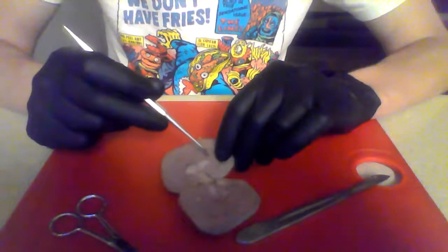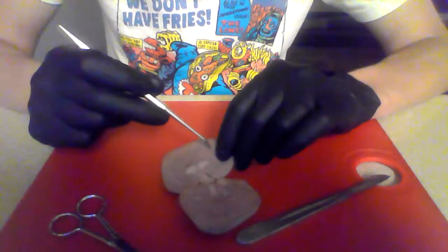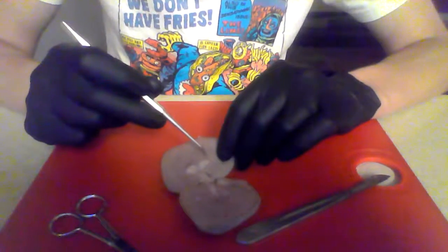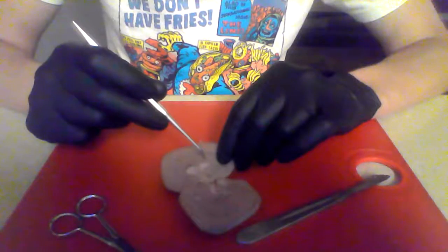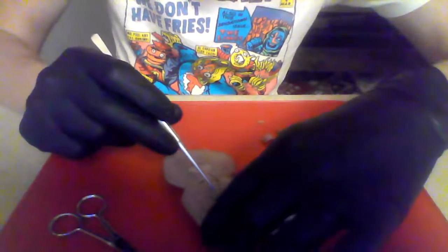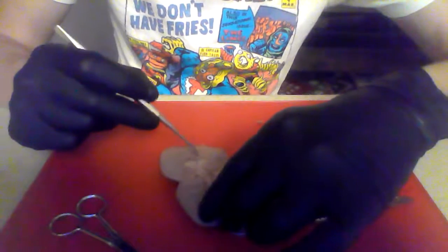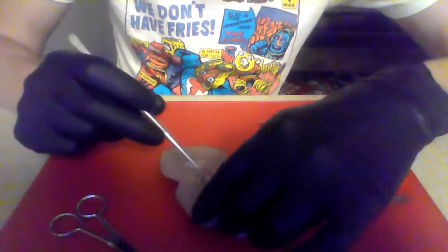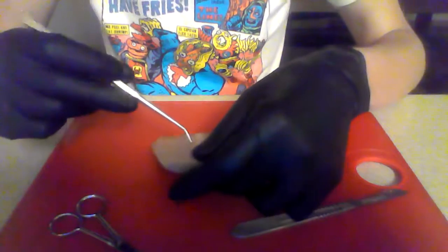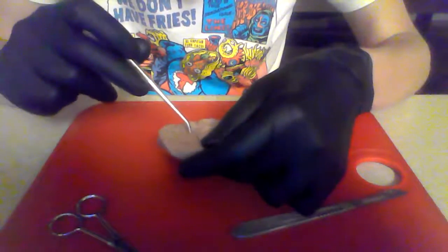I had mentioned before that we have renal papillae. What happens there is urine is discharged through the renal papillae into a structure that is called the minor calyces. And I tried to dig out the portion of the renal pelvis so I could try to at least see a minor calyx, and I think I may have found some, but it is hard to say for sure.